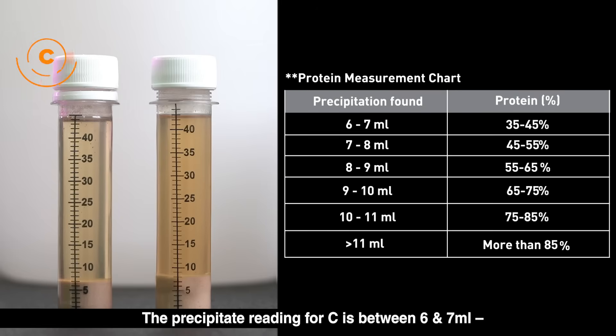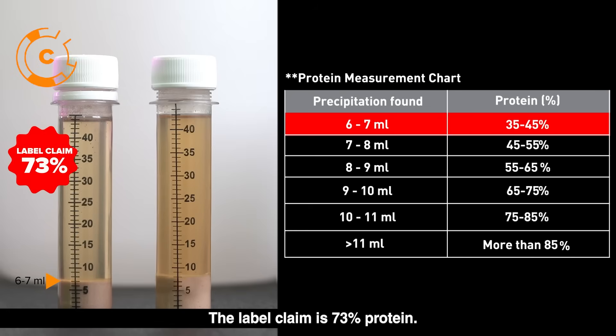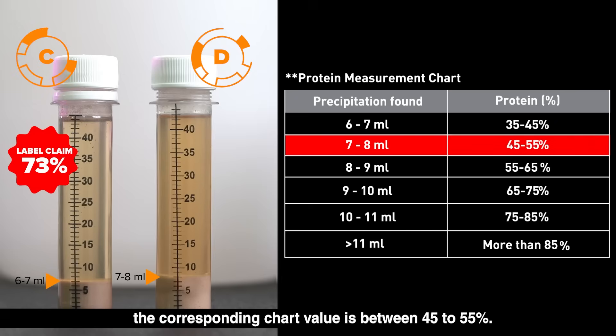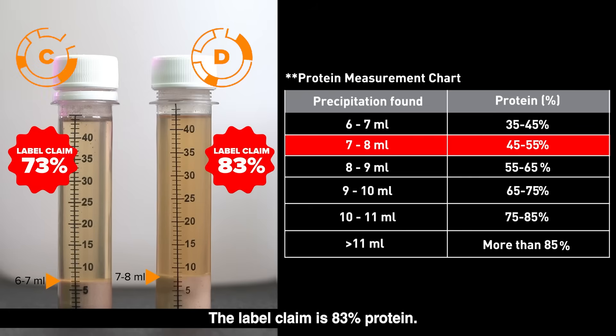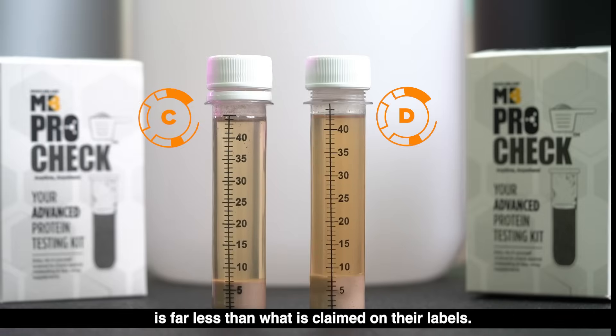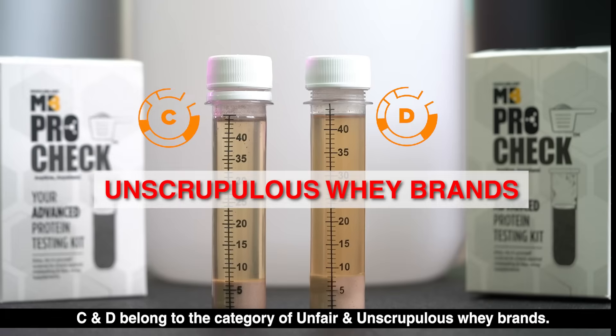The precipitate reading for C is between 6 and 7 ml; the corresponding chart value is between 35 to 45 percent. The label claim is 73 percent protein. The precipitate reading for D is between 7 and 8 ml; the corresponding chart value is between 45 to 55 percent. The label claim is 83 percent protein. Therefore, the actual protein content in supplements C and D is far less than what is claimed on their labels. C and D belong to the category of unfair and unscrupulous whey brands.